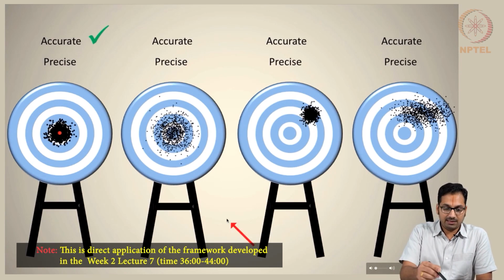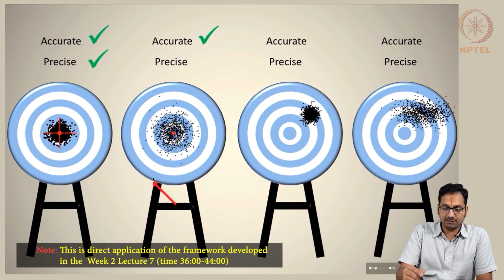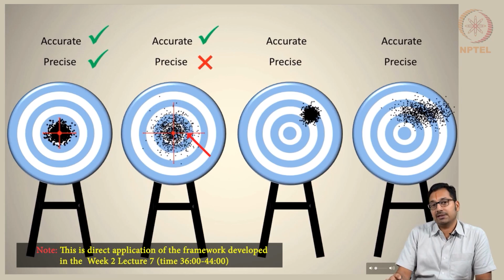What you end up seeing is that if you want to hit the middle of the dartboard, the average nicely comes up to the middle, and the standard deviation is fairly within the first circle. On the other hand, in the second case, although the average comes up nicely at the center, the spread of the points is quite a bit. You are able to realize some of the points are even falling beyond the 3 standard deviations, which does make sense because you are looking at 0.3% of the values which might end up falling out.